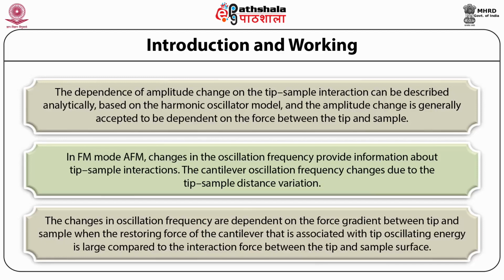Therefore, the FM mode in AFM detects the force gradient rather than the force itself. This is a factor enabling FM mode AFM to have higher spatial resolution than AM mode AFM.